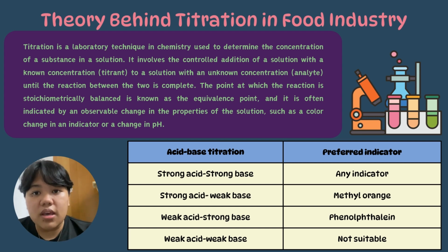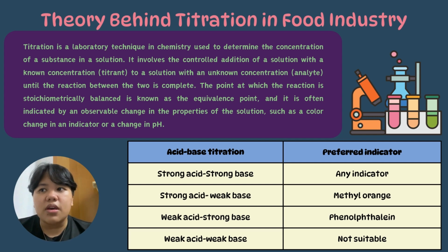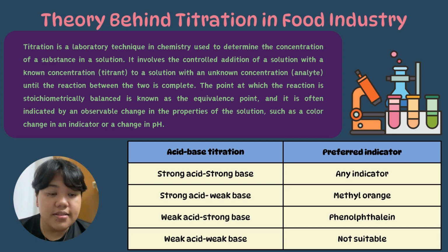And lastly, weak acid and weak base, for which there is no suitable indicator because the reaction between a weak acid and a weak base is very slow in nature that no steep rise occurs. Hence, no indicator can be used to detect the endpoint.